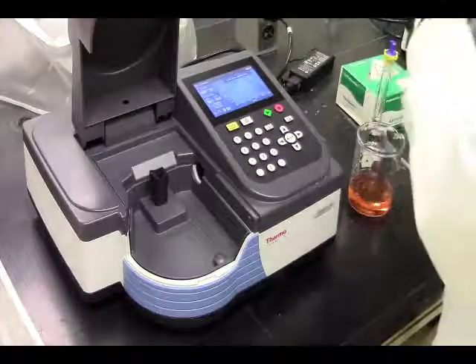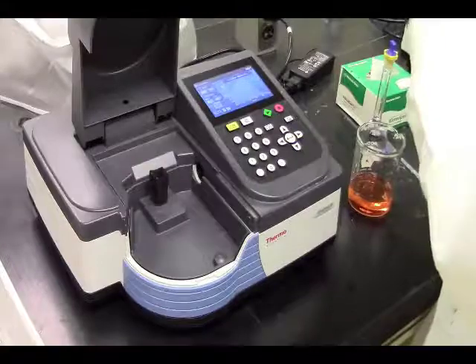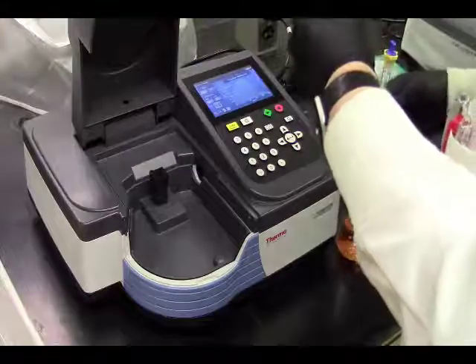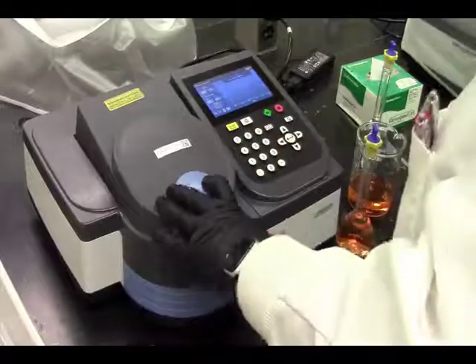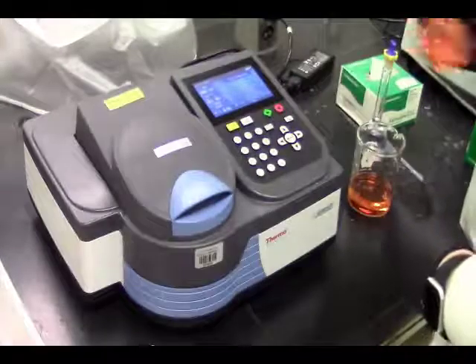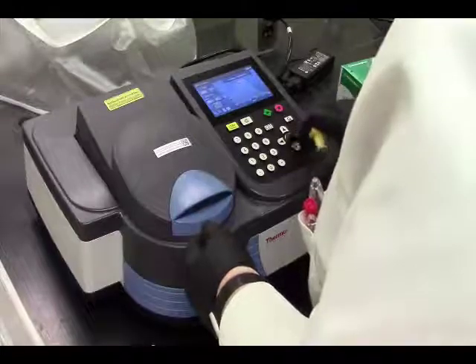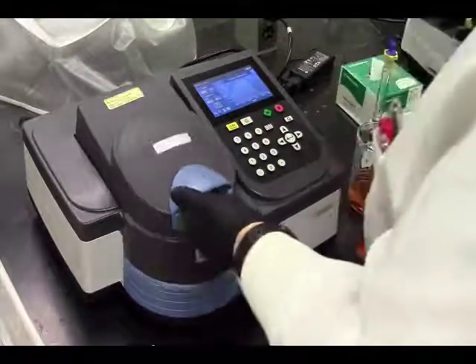We're going to rinse. Lambda max is 510. Yep. 5 mils. Yeah, that was the 5 mil. We're going to pop this in. Make sure it's lined up. Read this one. This is our 10 mil. Record this at 510 at 0.210.